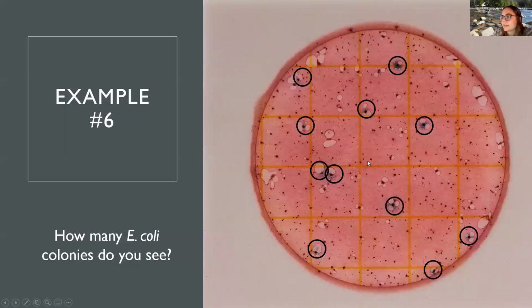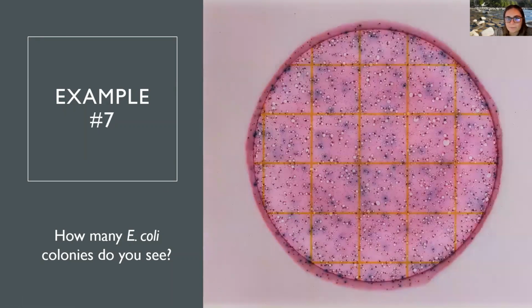But again, it's hard to see over a screen, especially since I'm sharing my screen and then you're viewing it through a screen. So we can take those things into consideration. But those are all really tight numbers, a tight range, so that's good. All right, what do we think for this one? Example 7, yeah, TNTC, good job, everybody.